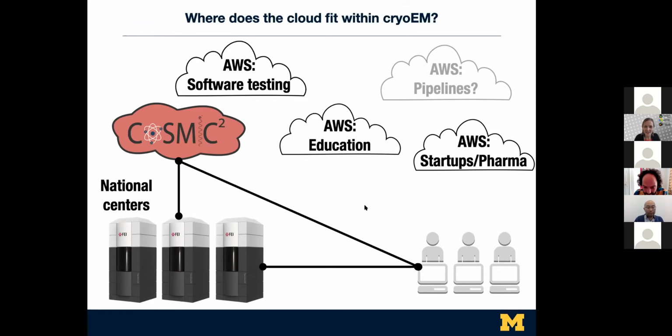There's a question about cloud computing when you're using a graphical interface, like selecting particles, refining beads, or doing tilt series alignment in tomography. Can you touch on that? Sure. With all of our Zoom and virtual meetings now, your internet is important, and it'll be as good as your internet is.